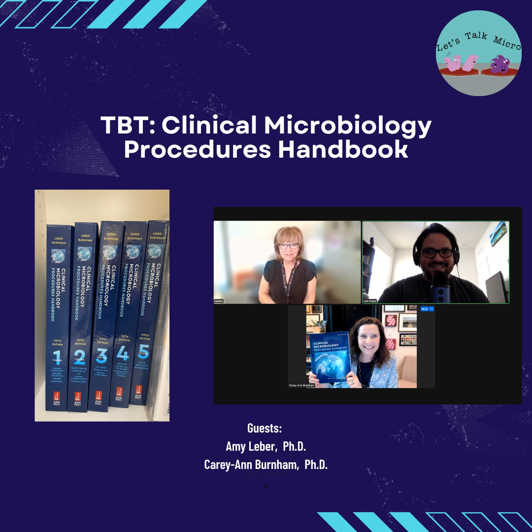Okay, and the next question is also that it is helpful for everyone, but I think also for people that are just coming in brand new, medical lab scientists, you're starting to work in micro, so you see all this information on how to work your cultures or what to do, your guidance. So how does the information that's in the book relate to the work that we do in clinical micro in the lab? Oh, I'm probably a little biased, but I think it directly relates to the work that we all do in the lab. So the SOP part, the analytical part, is often a step-by-step guide that's meant to really guide us in our work.